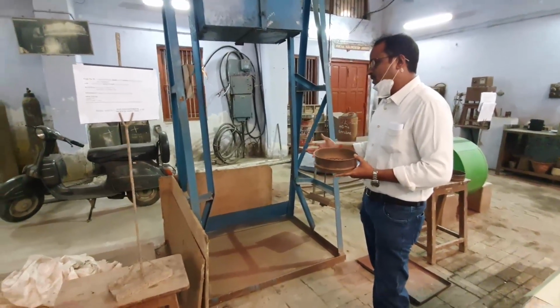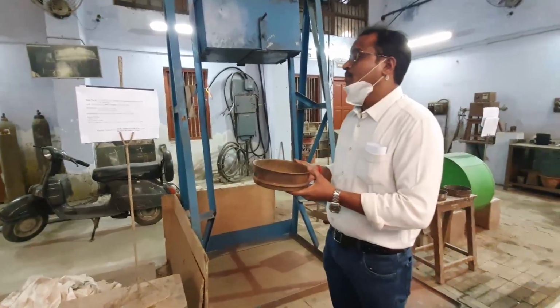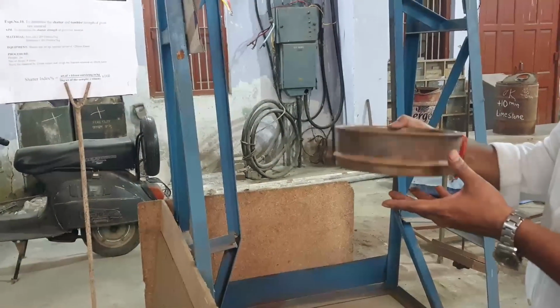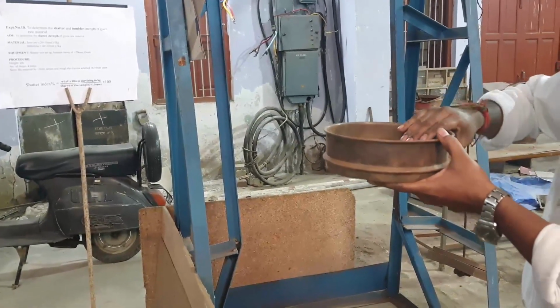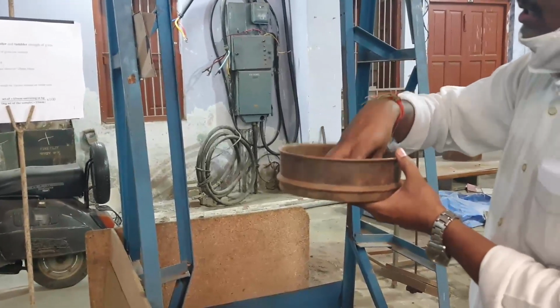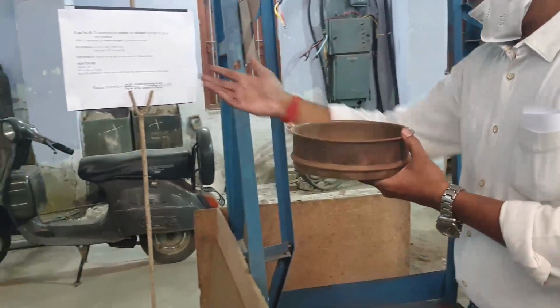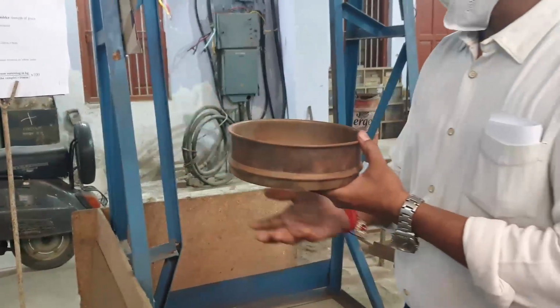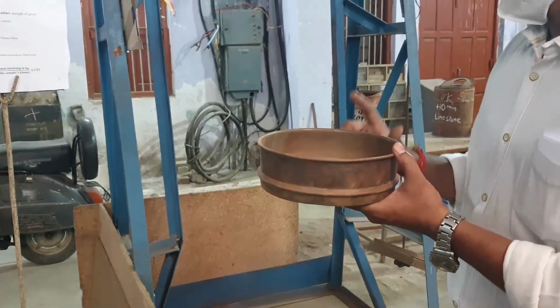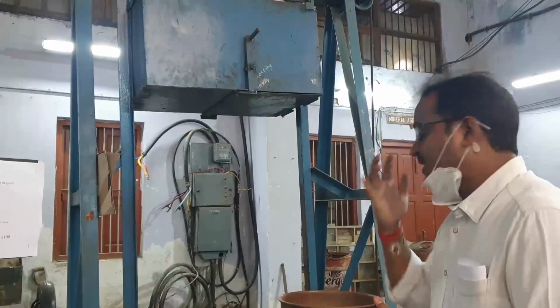After 4 times, we collect that material, and by using this plus 10 mm sieve, with the help of this sieve we will do the screening of that material. Whatever the material passing through this 10 mm, that we will not take. Whatever the material retained on the screen, that is plus 10 mm, that weight we will put in the numerator, and in the denominator we will keep the initial weight of the sample which we have taken, that is 5 kg, into 100, that will give the shatter index. This is a very simple experiment. This is about the shatter index test.